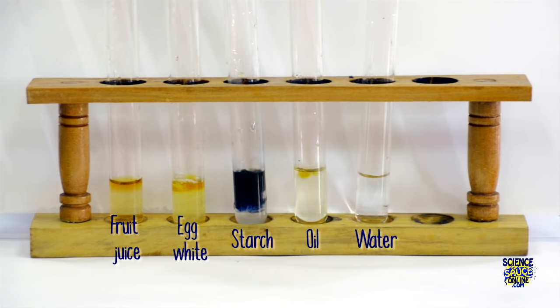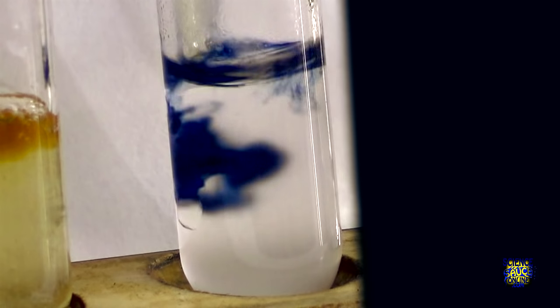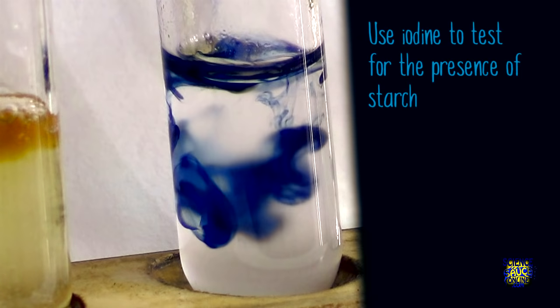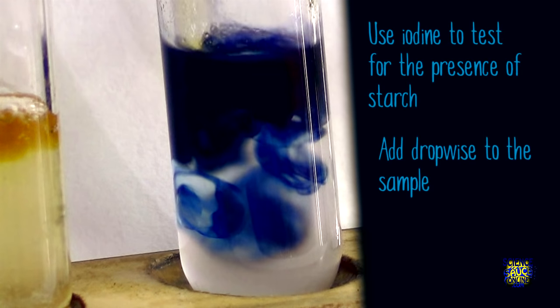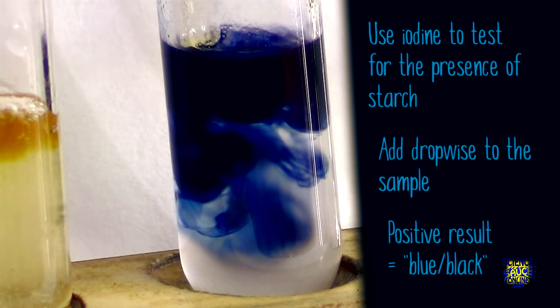We continue adding this to all of our samples and amongst all of them starch is the only one that shows a positive result. So to summarize, we use iodine to test for the presence of starch. You add it dropwise to each of your samples and it turns blue-black if starch is present.